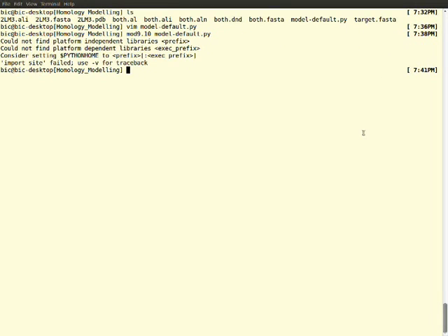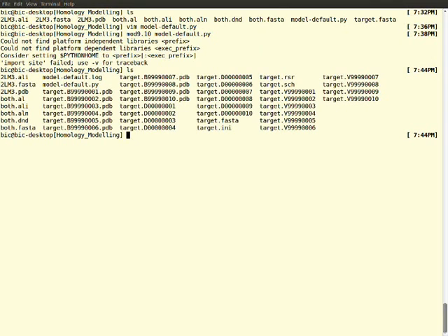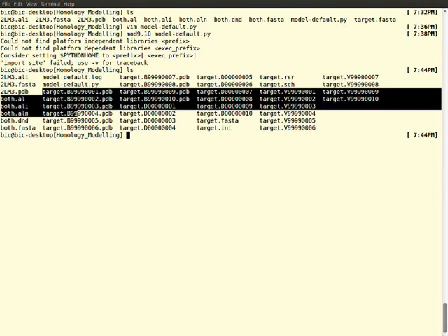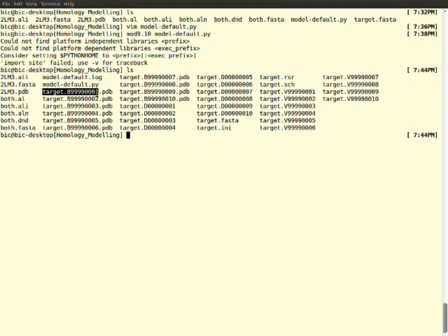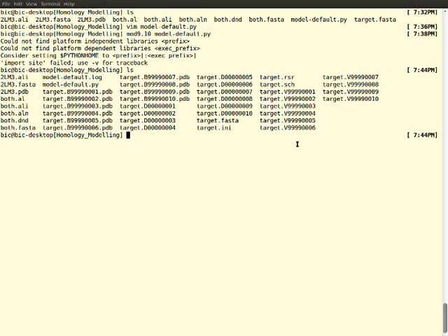Now if you see the folder, you have got a lot of files generated. You can see lot of 10 models which we mentioned have been generated, from 1 to 10, and log files. The important thing to consider first from your homology modeling result is the log file.